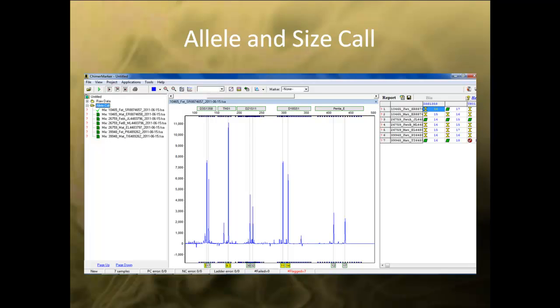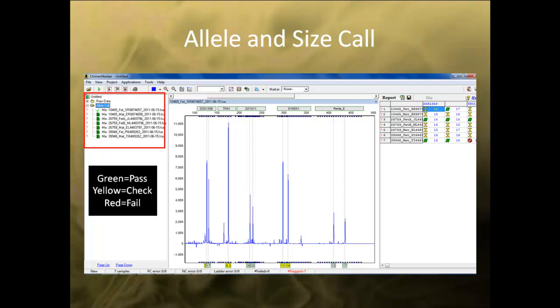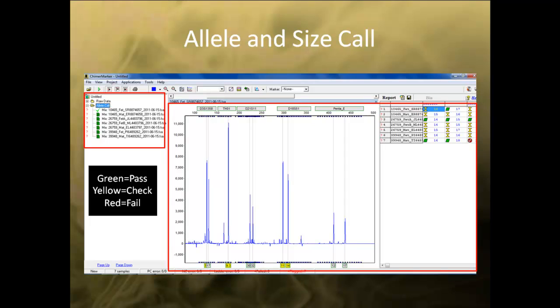Once the analysis is finished, the browser pane will display a list of the samples with color-coded sheets in front of each sample. Green means that size calling was good, yellow indicates a need for review, and red means the sample failed to size call. You can also review the allele call by using an electropherogram and report table. Use the Help menu located in the top right for editing and navigational tips.